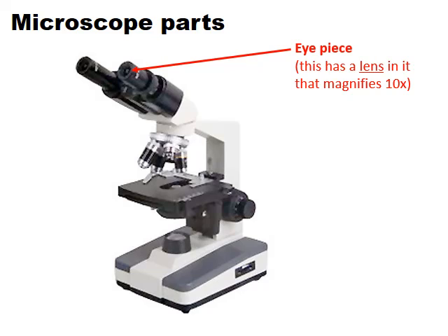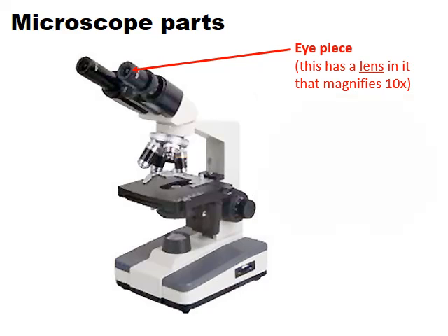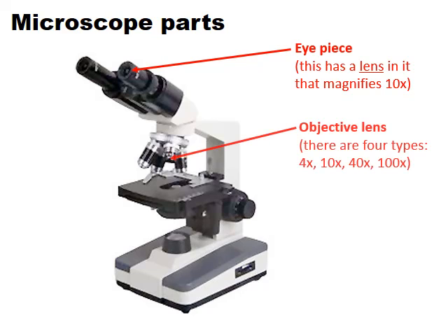Each eyepiece has a lens of ten times magnification within it. You'll also see down at the eyepiece a small scale called the eyepiece graticule, which we're going to use later to measure the actual width of different structures viewed down the microscope. There are four other objective lenses we could use.